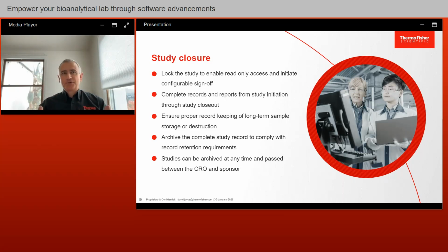into the front of house. The archiving capability is necessary when you look at a big CRO and they've been doing thousands of studies over an extended period. You don't want all of those studies to be live and online in your system, because it taxes the capabilities of the computer system if it's all live and active.